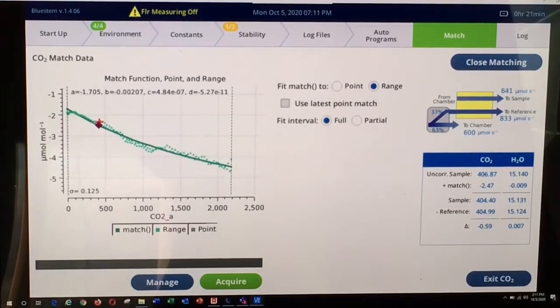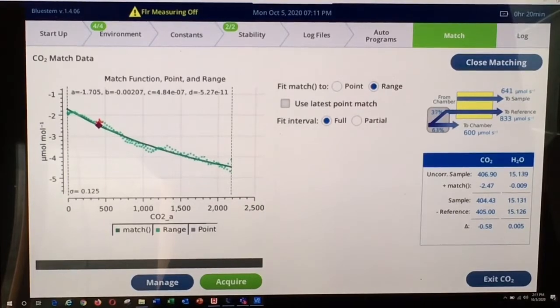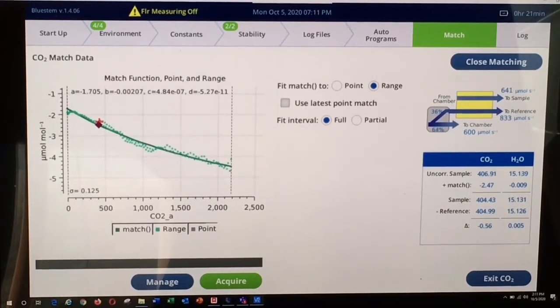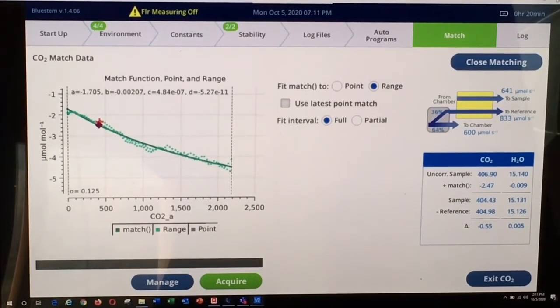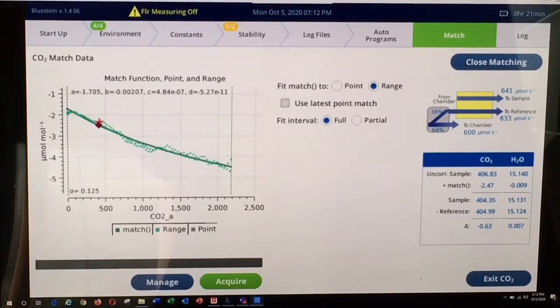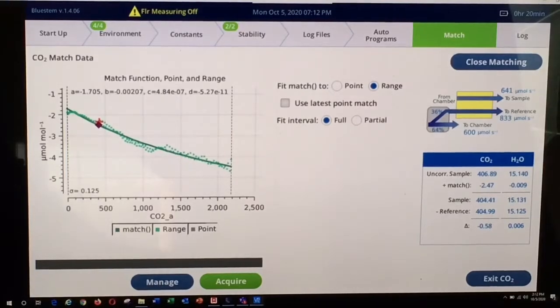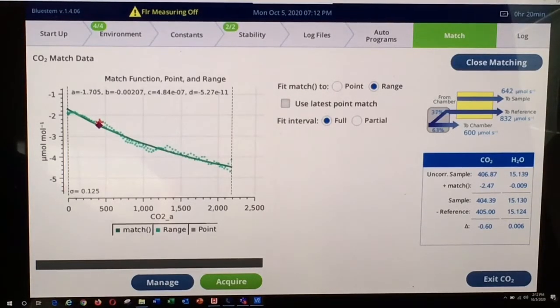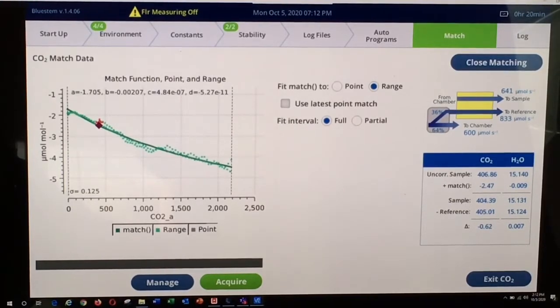When you press the View CO2 button, you are greeted with a screen that may look like this if you have previously conducted a range match. If there has been no range match previously conducted on your instrument, this screen will effectively be blank or it may just show your latest point match. In order to create a new range match, you'll need to select the green Acquire button at the lower left.